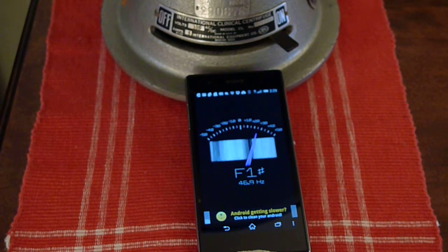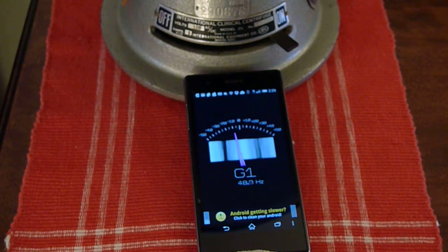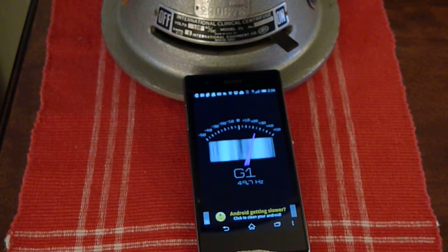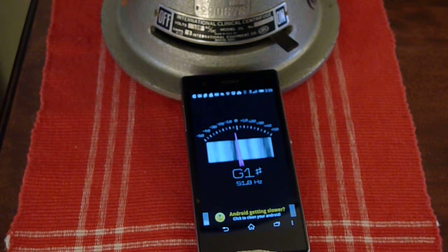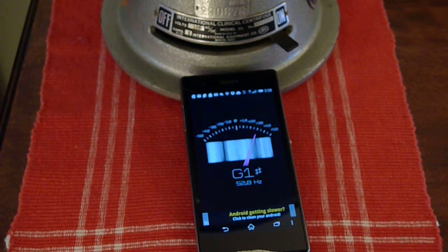I love turning it up all the way. 50 Hz, 51 Hz, 52 Hz. Now we're really spinning — 52 and a half. It kind of warms up, slowly increases. I don't know what that is — it's the old bearings.